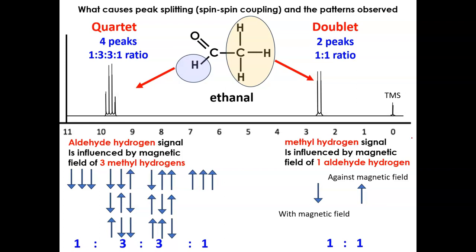Again, on the spectrum, where we'd expect to find them, the aldehyde hydrogen is down around 9.7 on the shift scale, and the methyl hydrogens are, of course, close to, remember, these are H's on a carbon bonding to a C double bond O. So these are not your methyl group on a hydrocarbon connection. These are H on a carbon bonding to C double bond O, and that is, remember, between 2 and 3 on the shift scale. Use your data sheet. Well, of course, that signal is now a doublet.